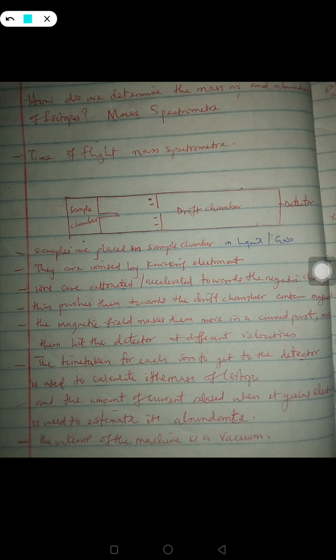So how does the time of flight mass spectrometer work? There are a number of chambers. The first chamber is the sample chamber, where you put the sample. Now, you have to be very careful with the sample. If you were asked to describe the working principle of the time of flight mass spectrometer, you must be able to mention that the first step is injection. Injection is the addition of sample into the sample chamber.